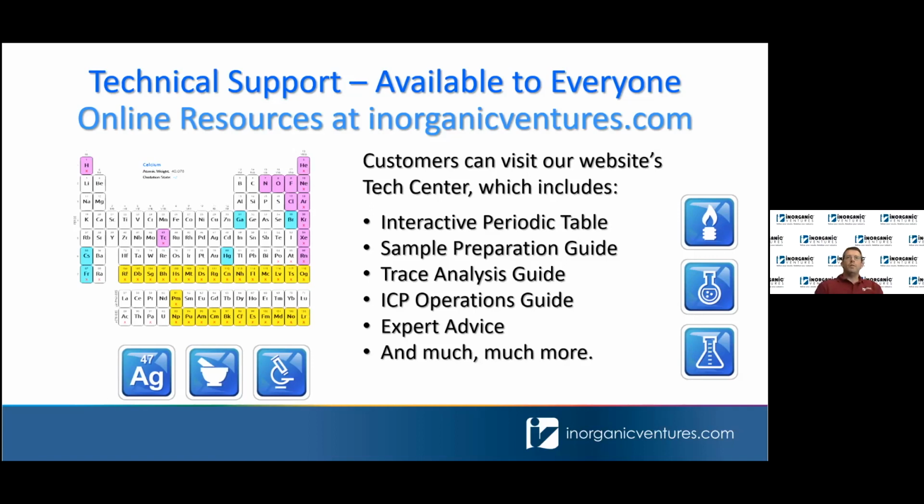So the next one, tellurium. Does tellurium form a stable chlorocomplex if the HCl concentration is high enough? And the example is, let's say 30%. And I think we know the answer to that one. Yeah, we actually have a stock product for tellurium. I believe it's a 10,000 ppm, and it does come at 30% HCl.